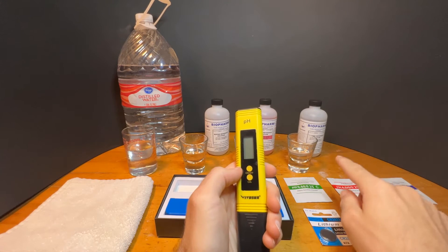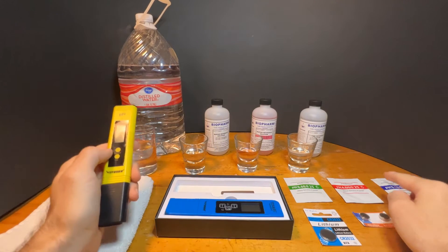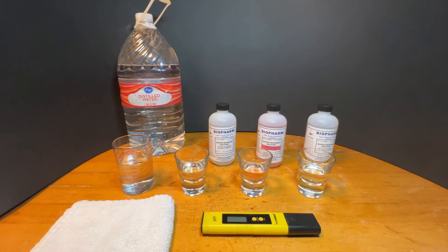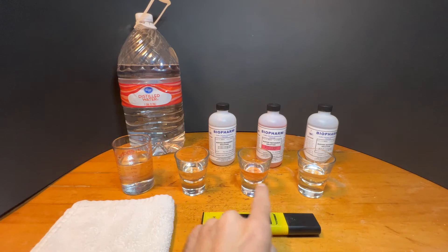I don't use the three powders that come with the kit. Instead, I recommend getting the three Biopharm pre-mixed solutions. To use these solutions, I set up four small glasses — one for distilled water to rinse off the meter before and between each solution, and one for each of the three solutions.